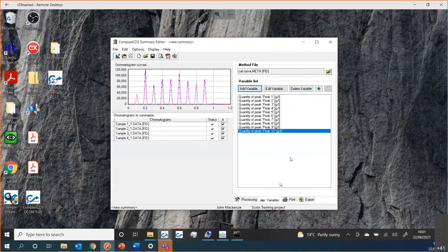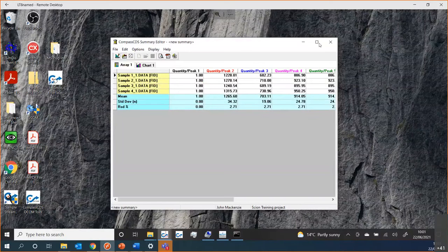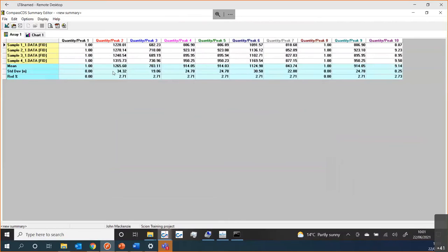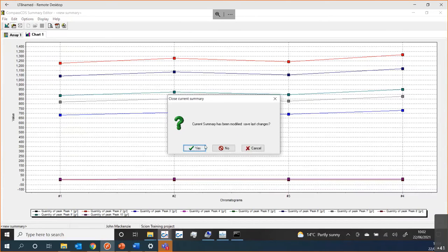I'll choose 10 peaks since I have 10 peaks, and I can then quickly see what that looks like. Making it full screen, you can see what my RSDs look like and what my result is for every single peak on my list. You can also see the standard deviation and control charts for each of those peaks, showing what the variation looks like — maybe there are some trends in the data, trending down or trending up. It would allow you to see that quite quickly.